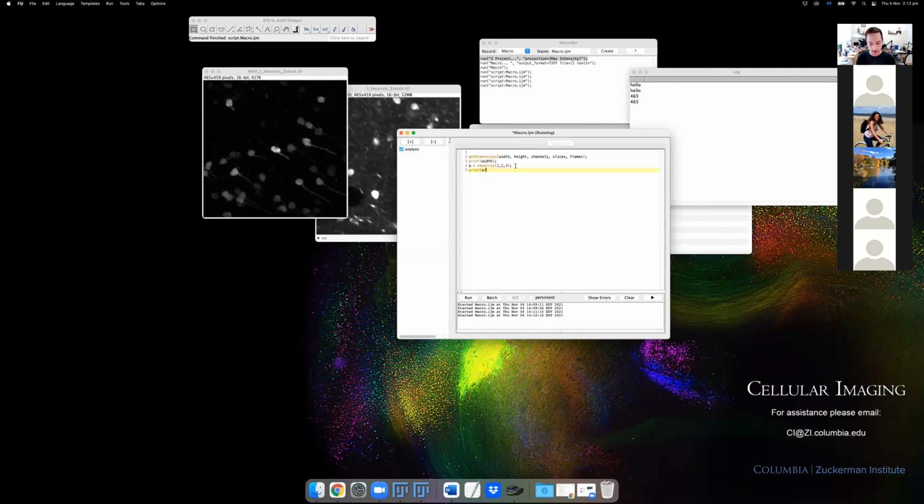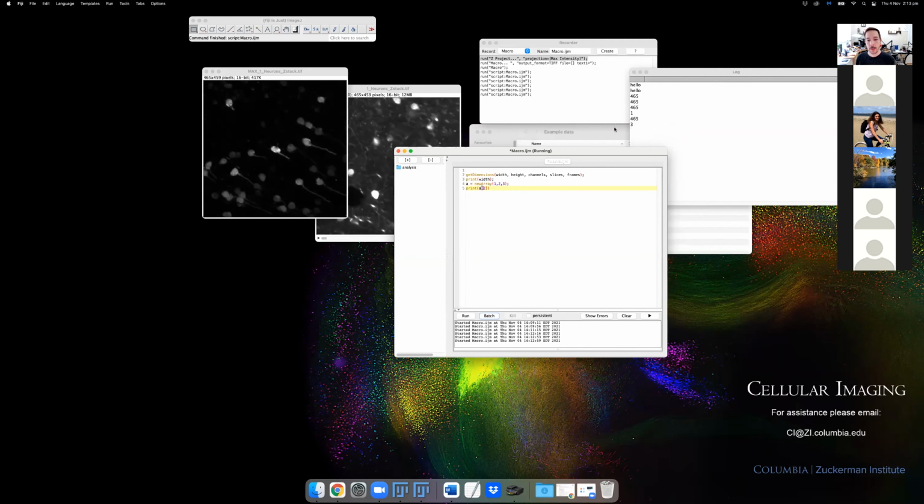So if I say A0, it's printing 1 here. And if I did 2, that will give us 3. And if you choose something that's outside of this array, so if I tried to get the third value, which would be a number that doesn't exist here, then we'll probably get an error. So it's saying that it's out of range.